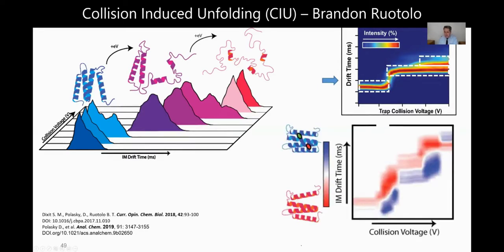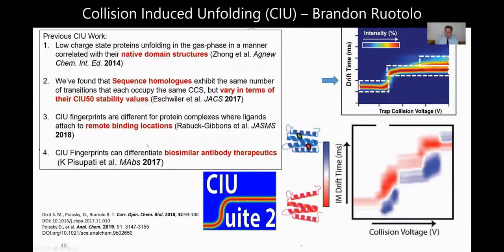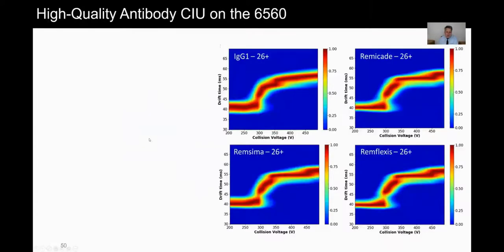In the early days, it was just the trapping voltage that we used. And we can actually compare one result to the other, and these are some difference plots that are shown. Of course, there's been a lot of work that's already been published on this, and I won't refresh all of that here for us today.